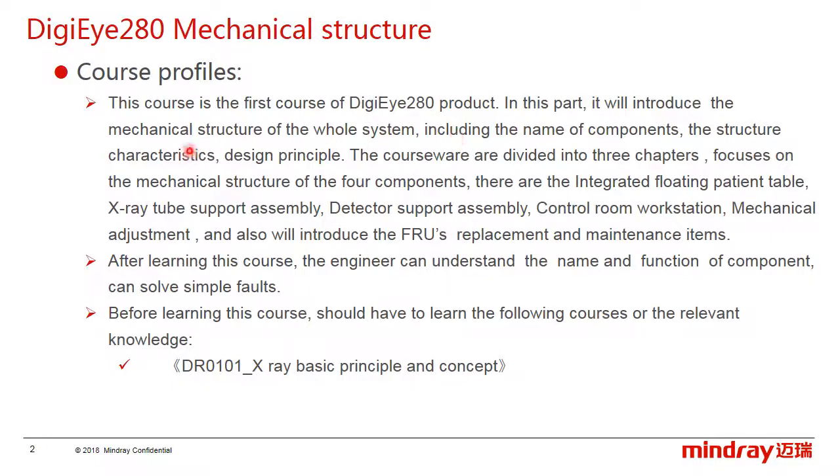In this part, it will introduce the mechanical structure of the whole system, including the names of components, the structure characteristics, and design principles. After learning this course, the engineer should understand the names and functions of components and can solve simple faults.